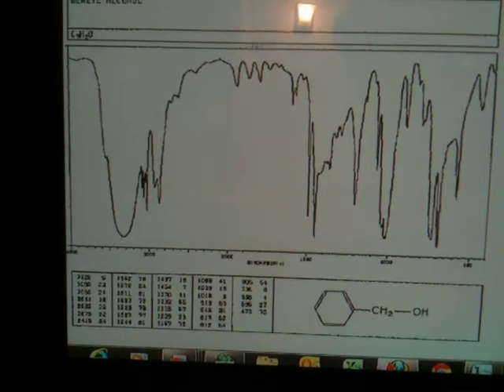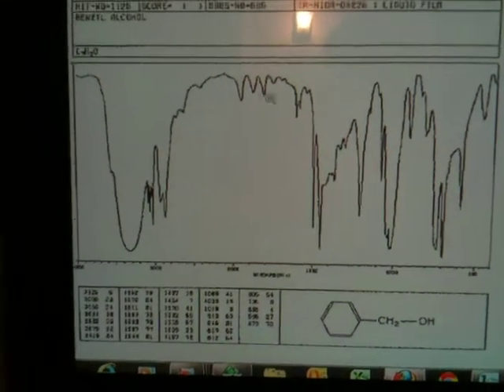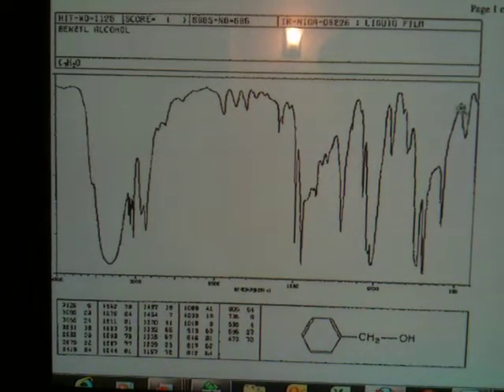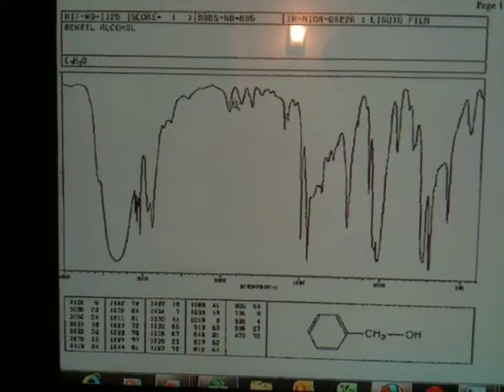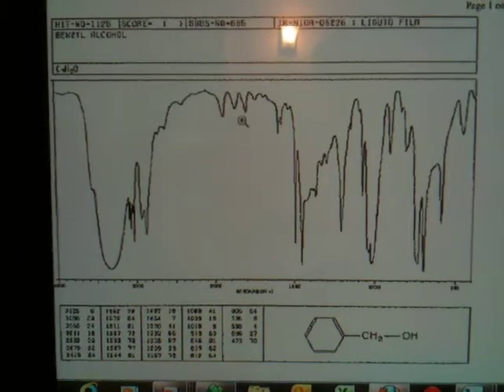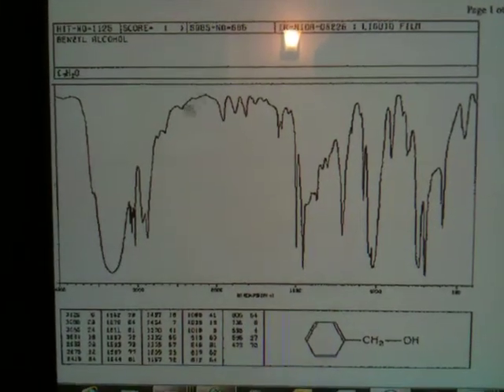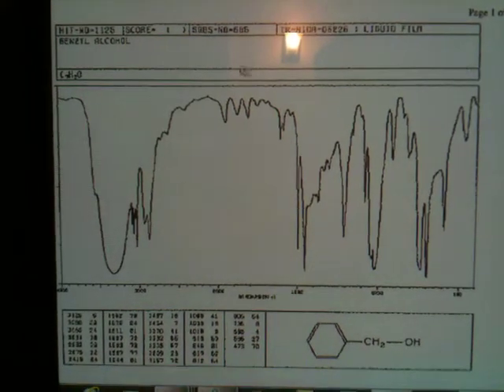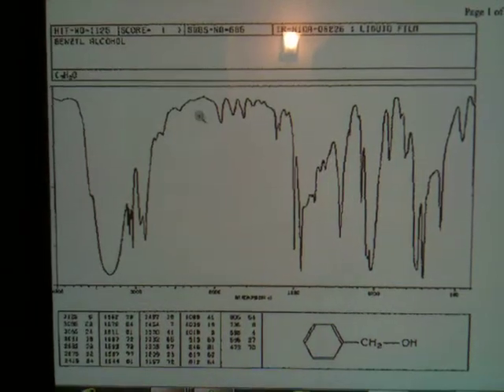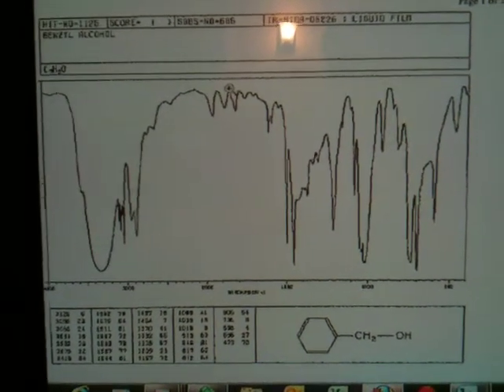The likelihood of that, because it's a larger transition, is relatively low. But these are 2 times some frequencies that occur down here. They're very small. But for aromatics, these are actually bending vibrations. For aromatics, they fall in this kind of clear region and they really stick out. And so they call these the aromatic overtones. They're harmonics if you're a musician. Okay? So when people see this, they go, oh my goodness, I've got an aromatic.